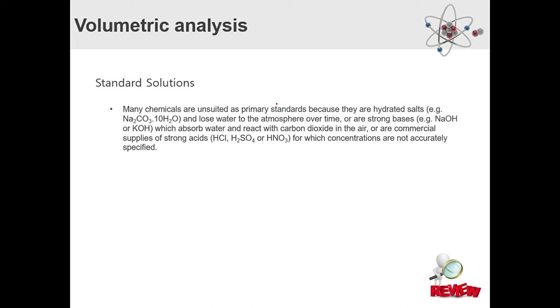Even if it starts being questionable at best, you can just go to Bunnings and buy more. It's less than $10 a bottle. Chill. And commercial supplies for strong acids, hydrochloric, sulfuric, or HNO3, for which concentrations are not accurately labeled.